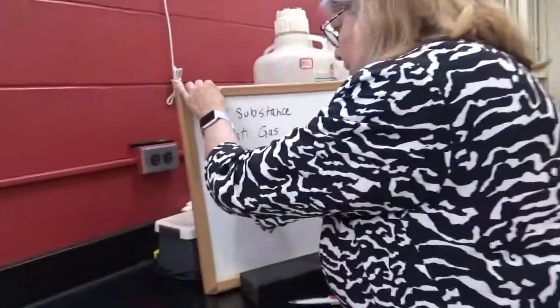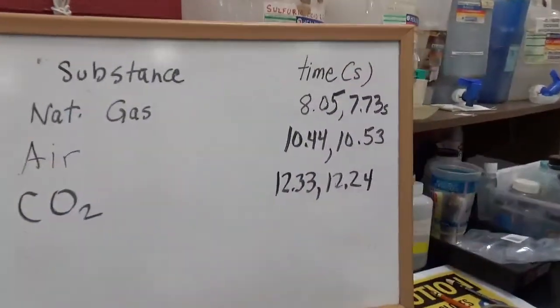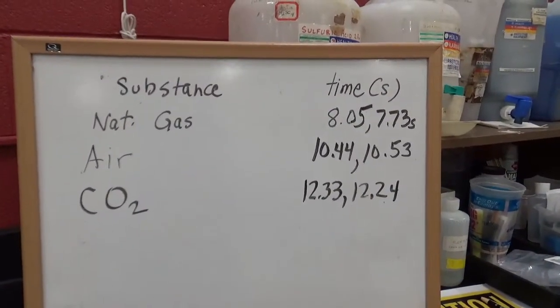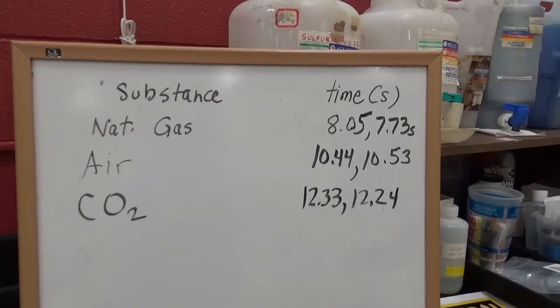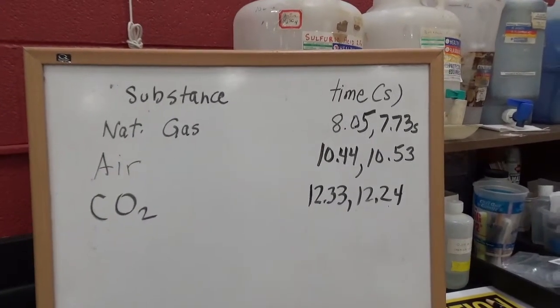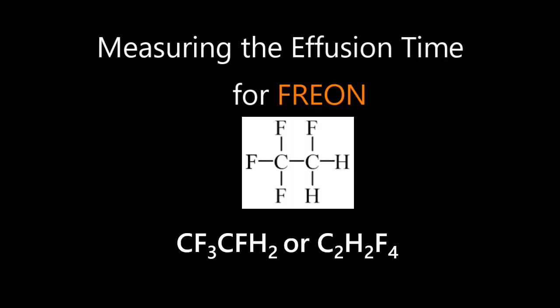And this is CO2. So here are our figures so far. And we're hoping that you'll also have your numbers. And we'll see what we get. I'm taking an average. Notice the numbers ought to be kind of close to each other since we're measuring the same thing.